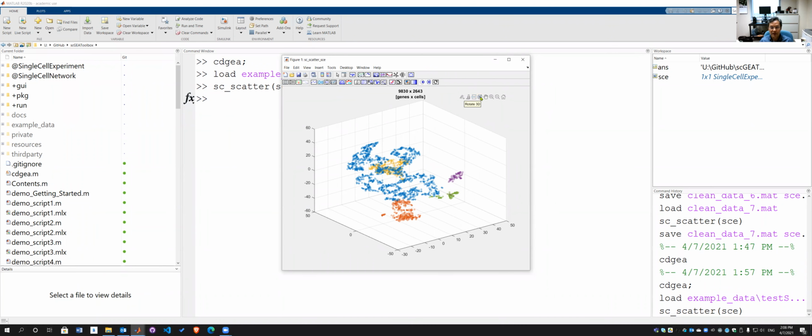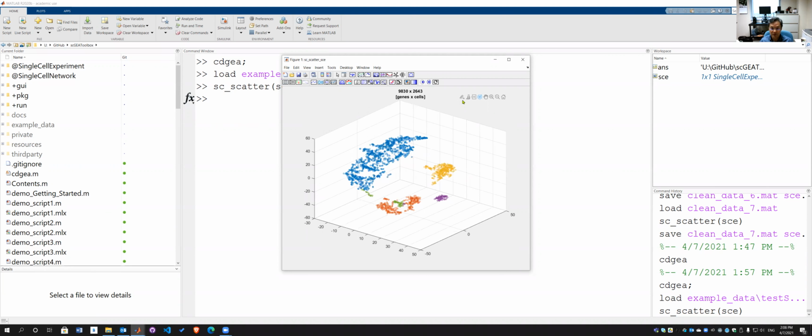If I want to build a gene regulatory network for one of the groups of cells, first I want to highlight, see this is a group of blue cells, so-called master cell, and then this is a pyramid of cells.